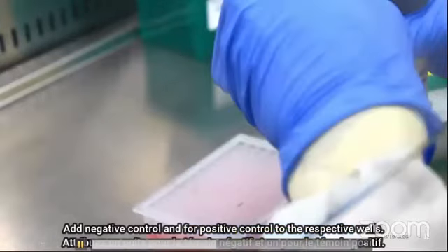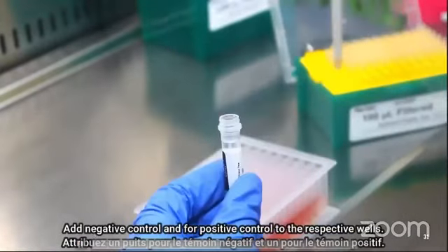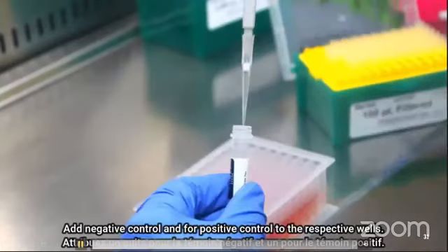After addition of the sample, add negative control.